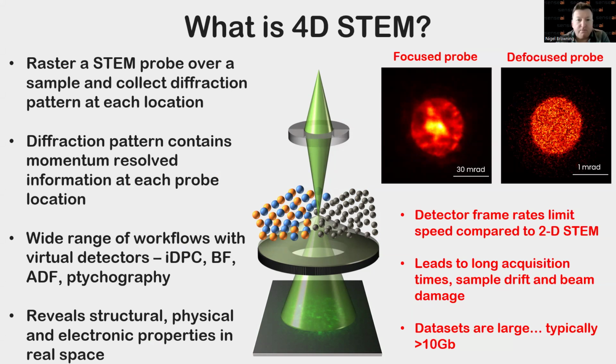That contains a wealth of information about the sample, which, by using virtual detectors like iDPC, bright field, dark field, or even doing phase retrieval with ptychography, we can extract a wealth of structural and electronic information about the sample. Typically, if you're doing a materials science sample and going for atomic resolution, you do this with an in-focus probe. If you're doing structural biology, you would use a defocused probe, but essentially the methodology is the same. The approach allows us to get all of this information, but is very data intensive.